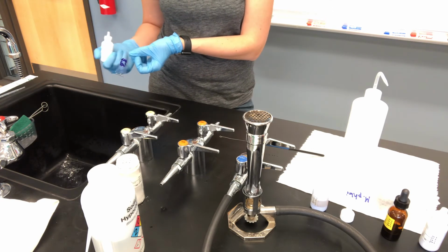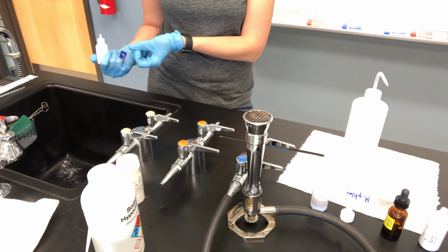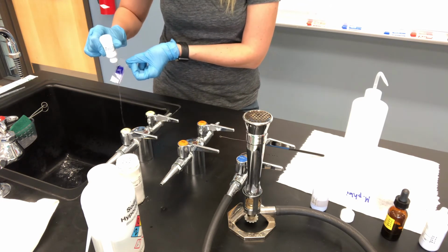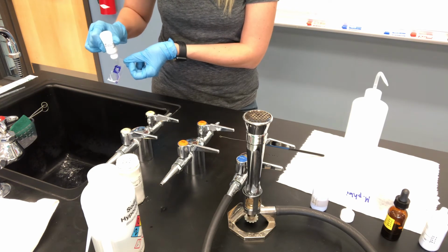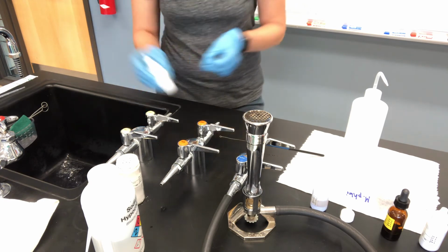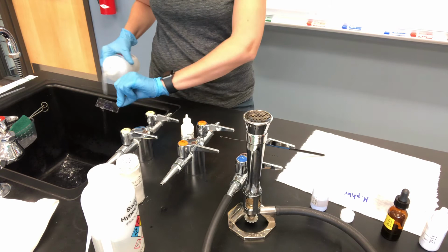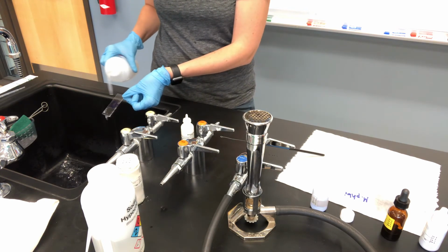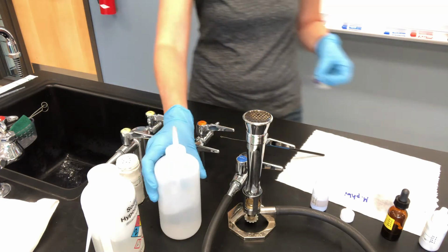It may not remove all of the crystal violet, but you'll know that you've removed enough when what's dripping off the corner of your slide is kind of a pale pinky color. So you'll see a lot of the purple come off at first, right? And then you just keep doing that until it's kind of a pale pink. And then you quickly rinse with distilled water. Because if we leave that ethanol on for too long, it can over-decolorize and remove the crystal violet even from gram-positive cells, and we don't want that. Okay.